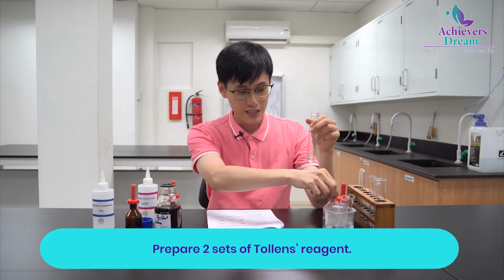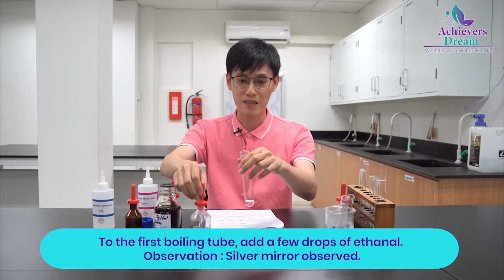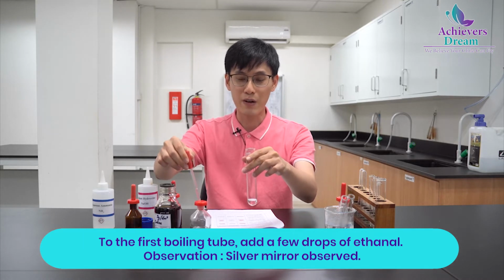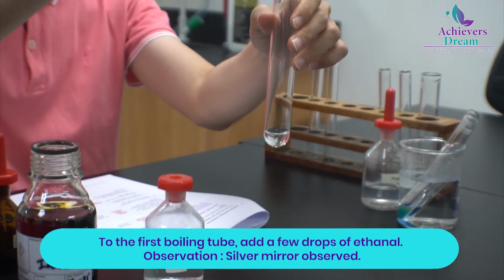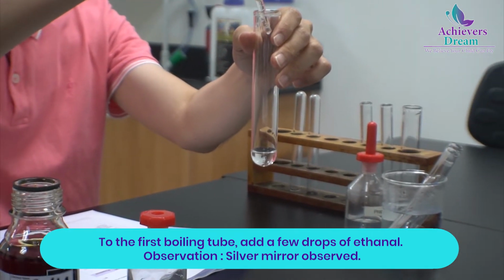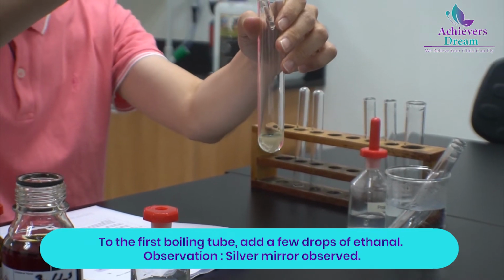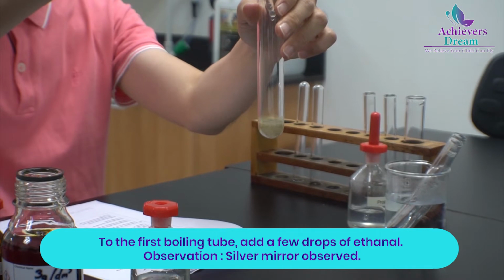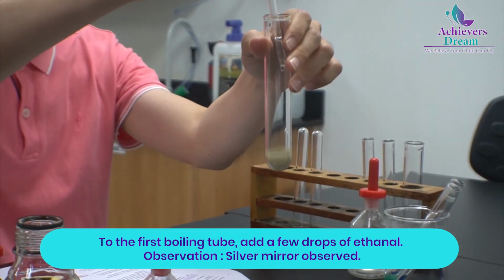I will be adding ethanal to it. Ethanal is an aldehyde. You know that aldehydes can be oxidized, so we expect to see a silver mirror. Oh, look at the silver mirror forming. It's not as shiny, but it will do.